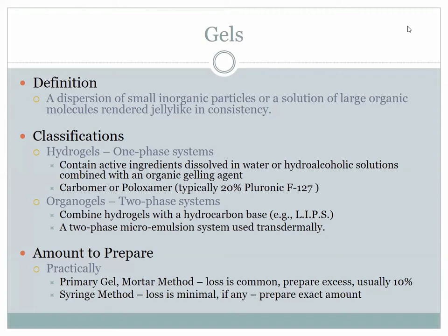And the gelling agent is the Poloxamer. So how can a liquid be a gelling agent? Because it's liquid only when it's cold. Poloxamer 20% forms a thermoreversible gel, meaning at cold temperatures, it's a liquid. So right now, it's the only ingredient I haven't set out. It's still in the refrigerator.